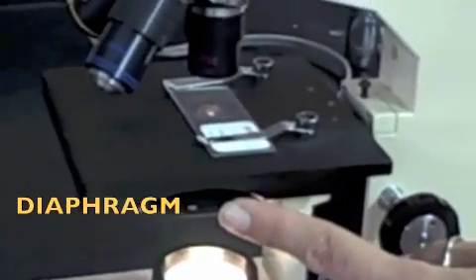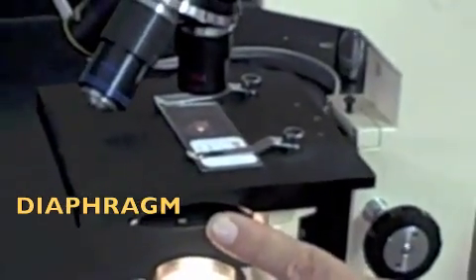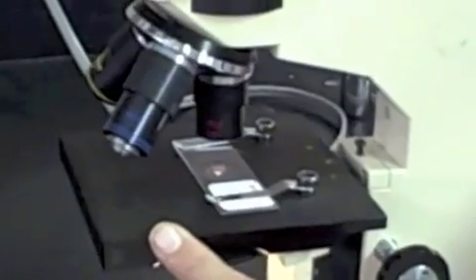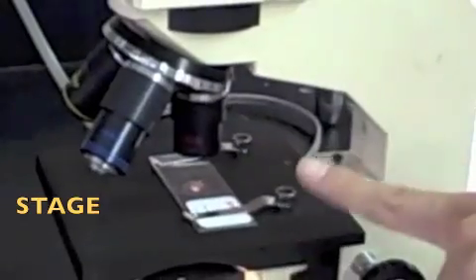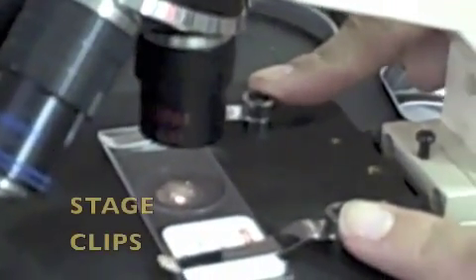It controls how much light is passing through the hole in this piece. What was the name of that piece? Okay, the stage. Perfect. How about these little pieces right here? What are they called? Stage clips. Awesome.